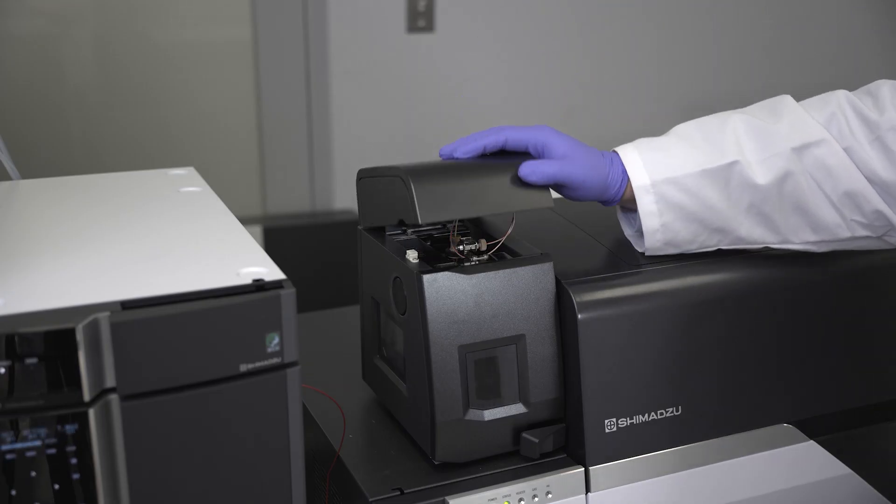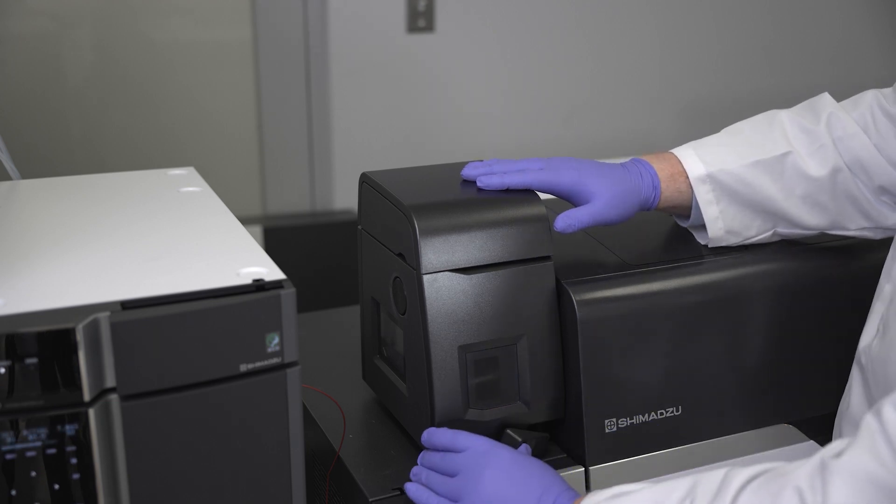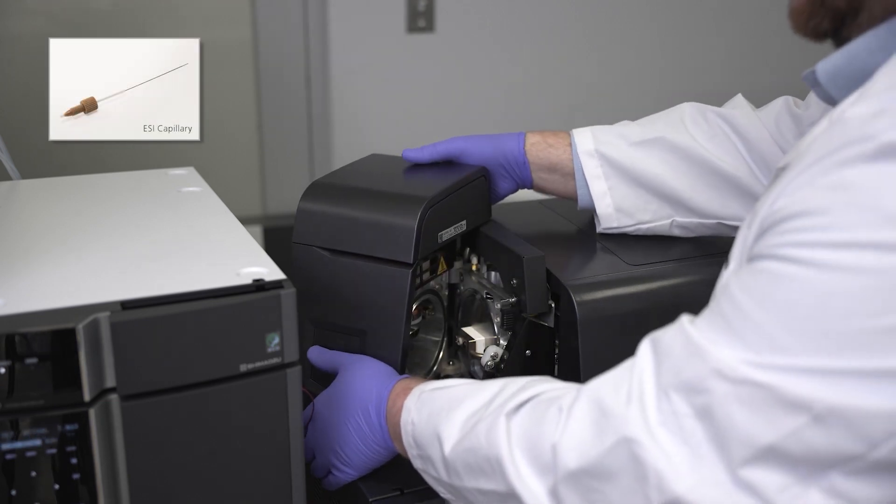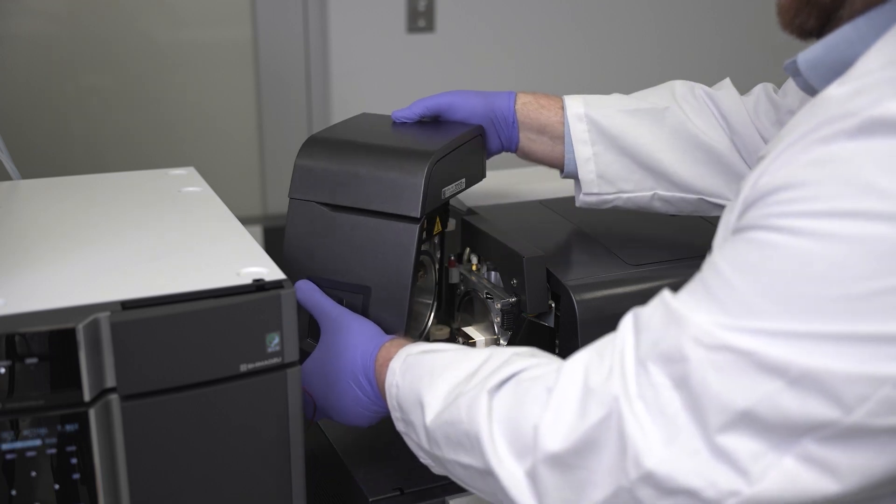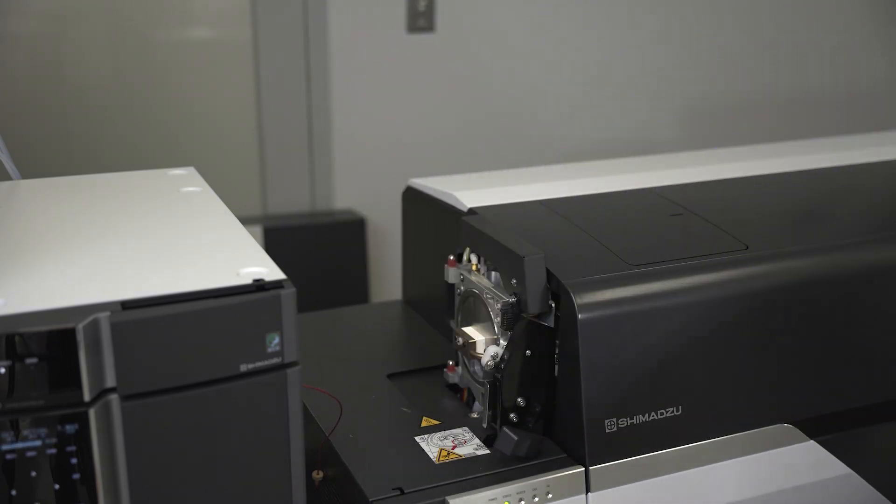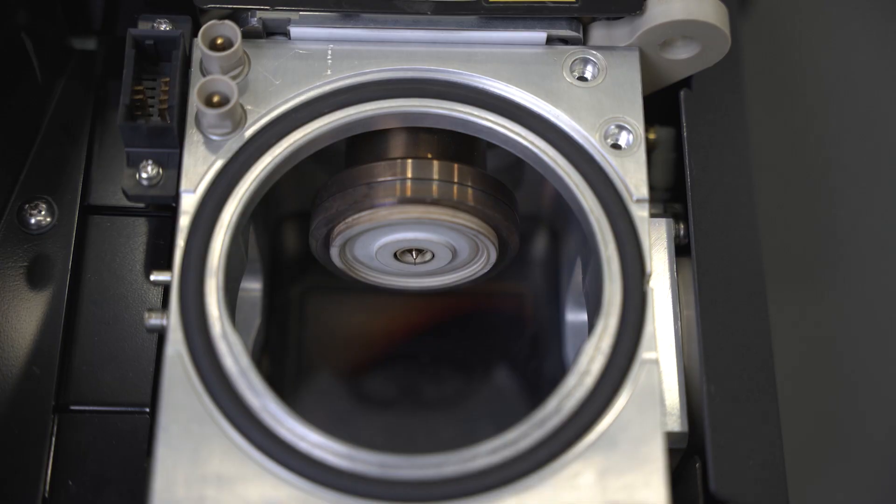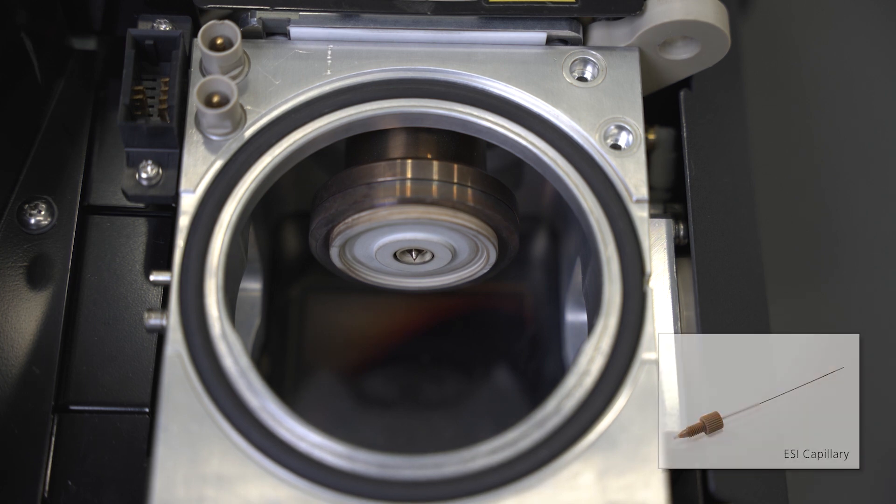Unlock and remove the ionization unit. Remove the corona needle, if present. Adjust the projection length of the ESI capillary to less than 0 mm to prevent injury to you or the instrument.